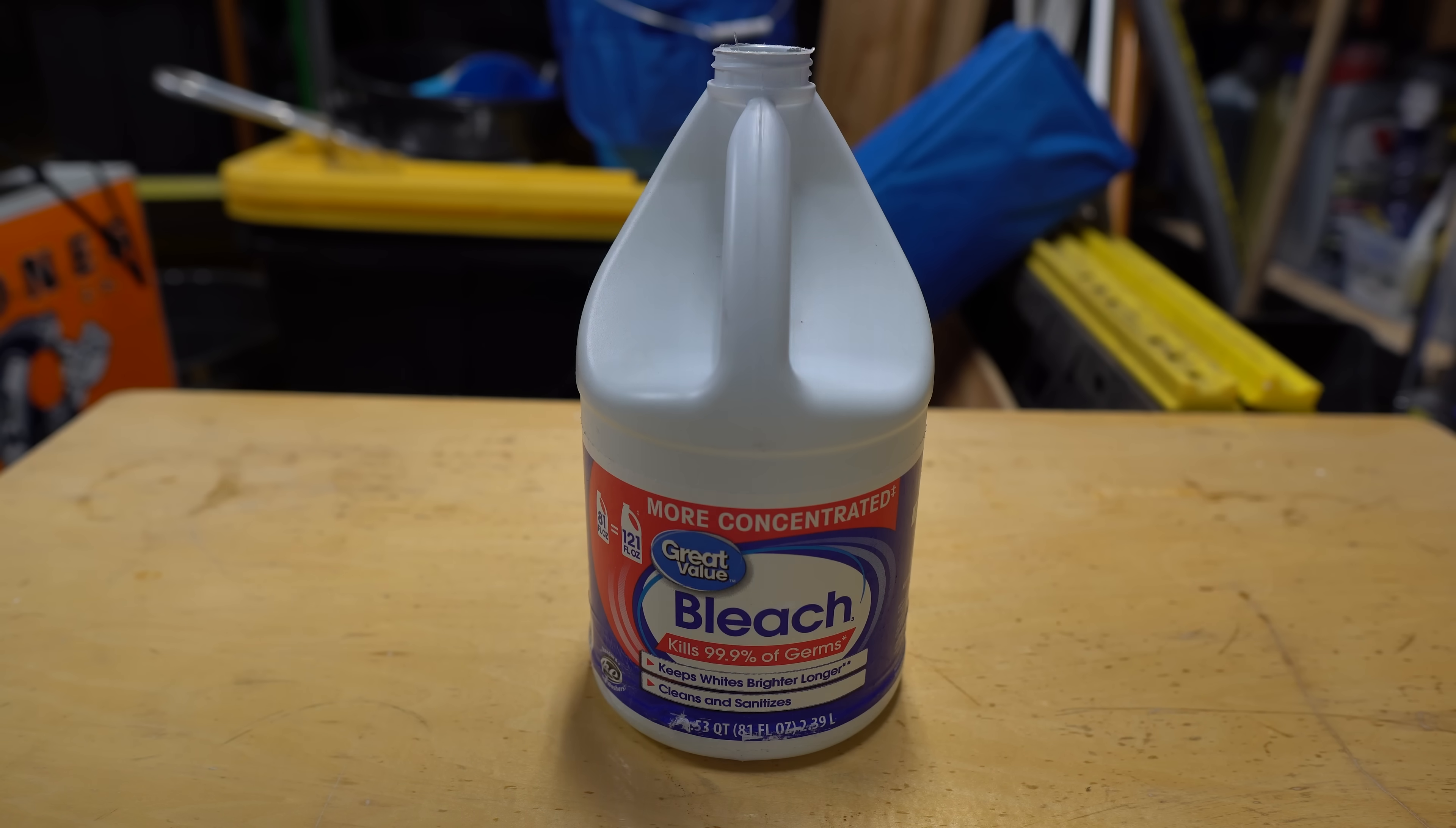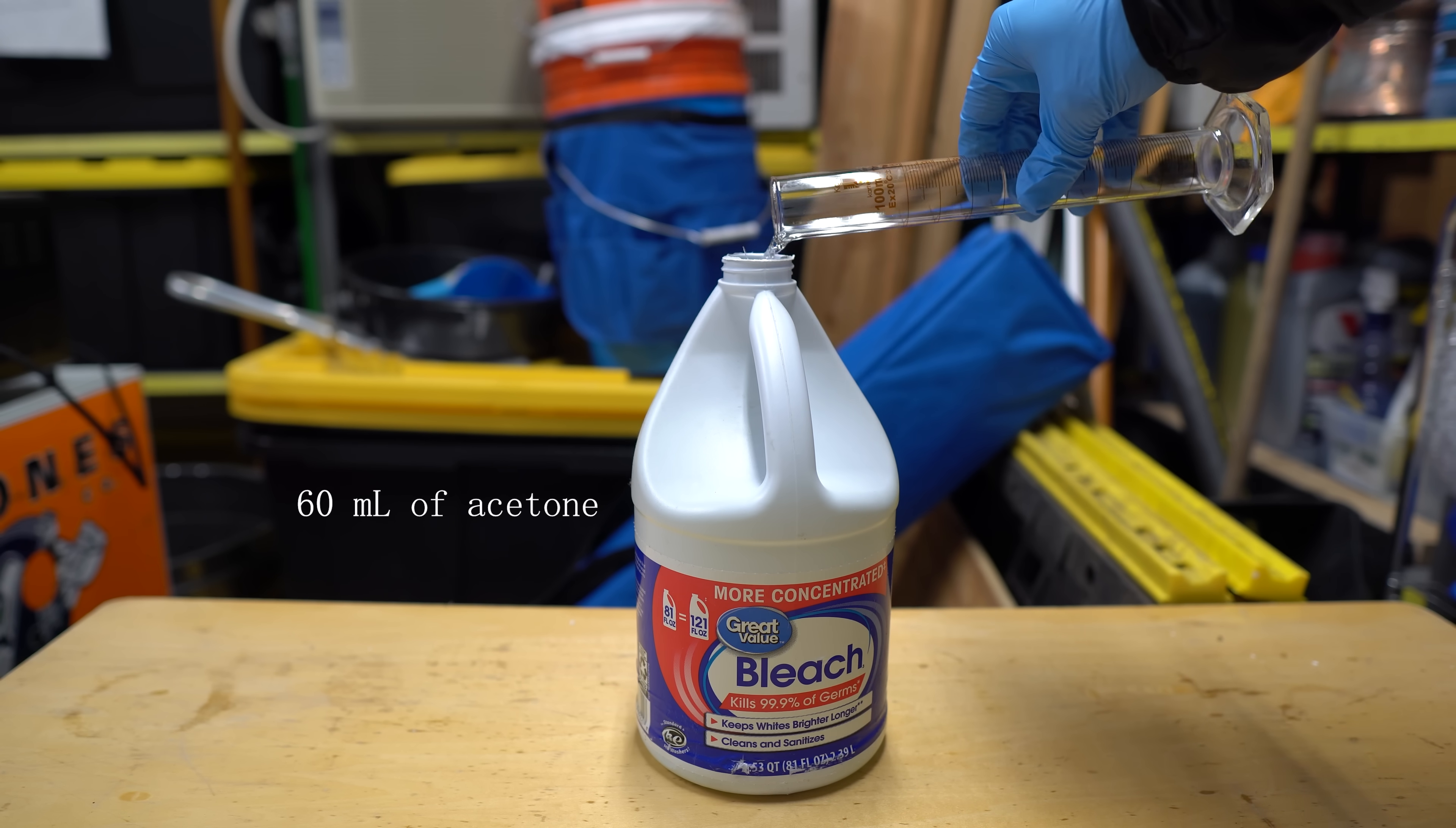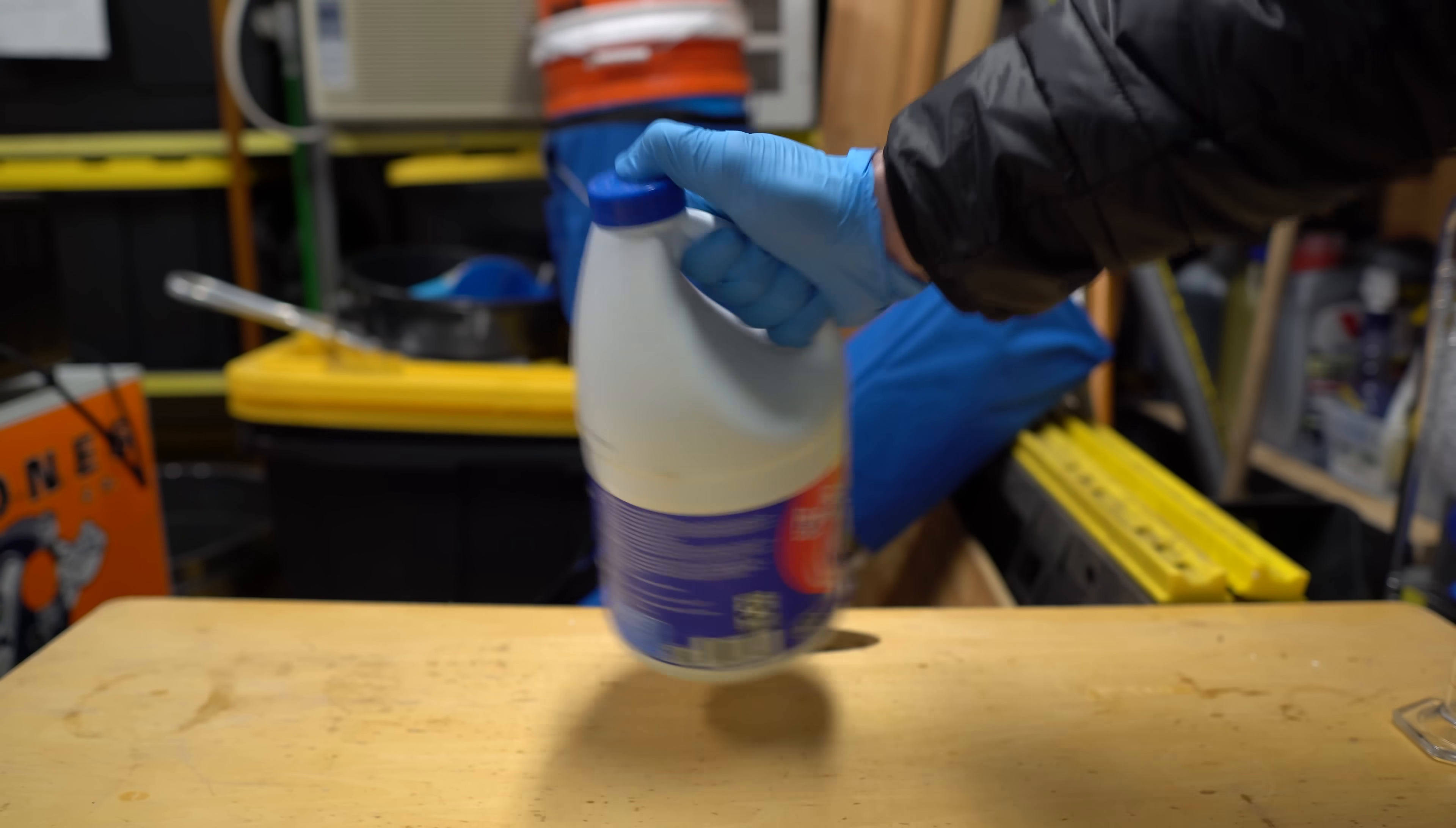We actually had to get a new bleach bottle just because I accidentally froze the other container, so I had to get another brand. I actually used a smaller container, about one-third the size, so I used about one-third the amount of acetone, just because there's about the same concentration of sodium hypochlorite as well. Just like before, all the steps are going to be the same. I'm going to shake it up, make sure everything's mixed together, but this time we're actually going to allow it to react for 12 to 24 hours.